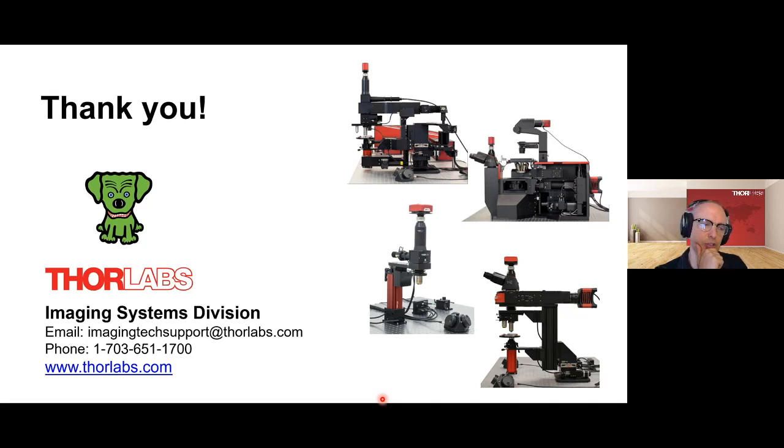You could check it by centering the scanners and illuminating a fluorescent sample, and then watching the light coming back out. You could use a laser safety card to trace the emitted light after the pinhole lens and see where it focuses, and then make sure the pinhole is right there.